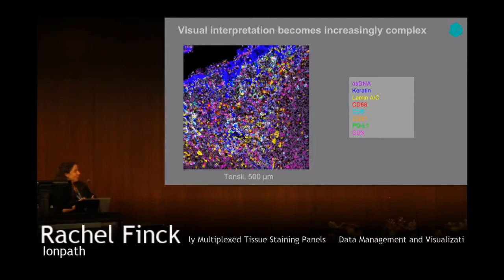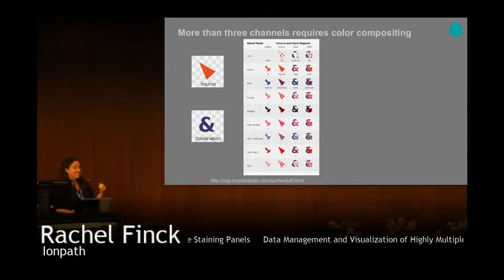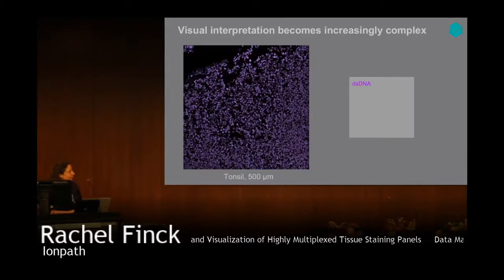But what I will point out is, again, just connecting what you're looking at quantitatively to the underlying data. As you're combining more than 3 colors, you are doing a mathematical transformation on the underlying data, because your RGB color space is 3D. And so just be aware that what you're seeing is a representation of some ion counts, and especially when you're looking at validation, go back and think about how this relates to what I actually measured.